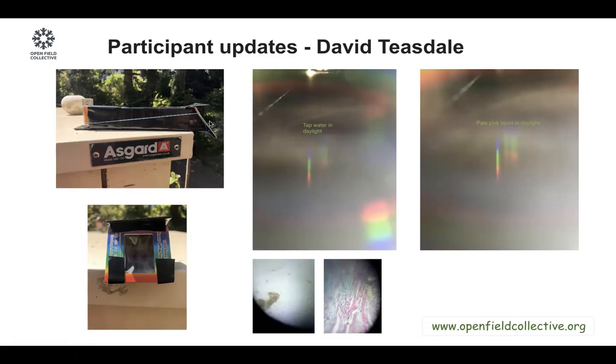Yeah. Another question is, won't we need fresh equipment each time? Otherwise, we will cross-contaminate. I think you can just wash the cuvettes with regular water. In the packages that we gave you, I think you have at least 4 cuvettes. Just wash the cuvettes, and it should be fine.